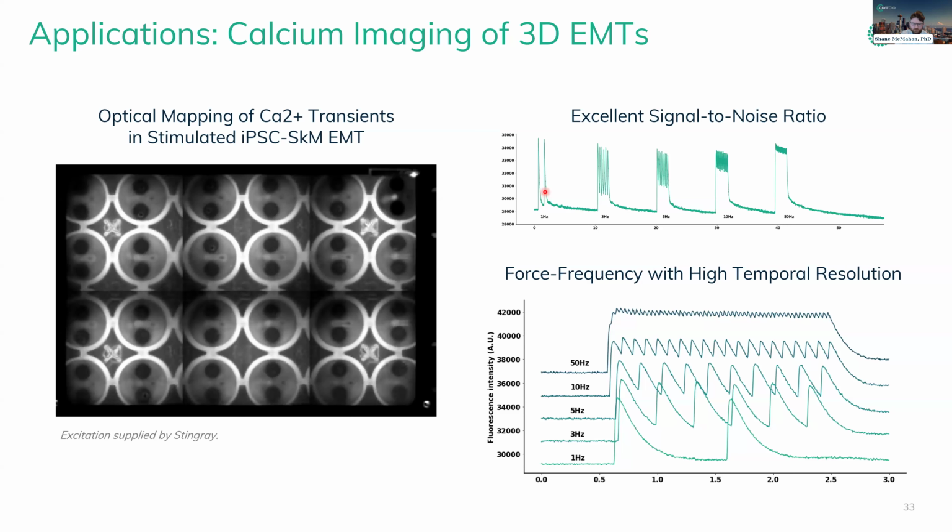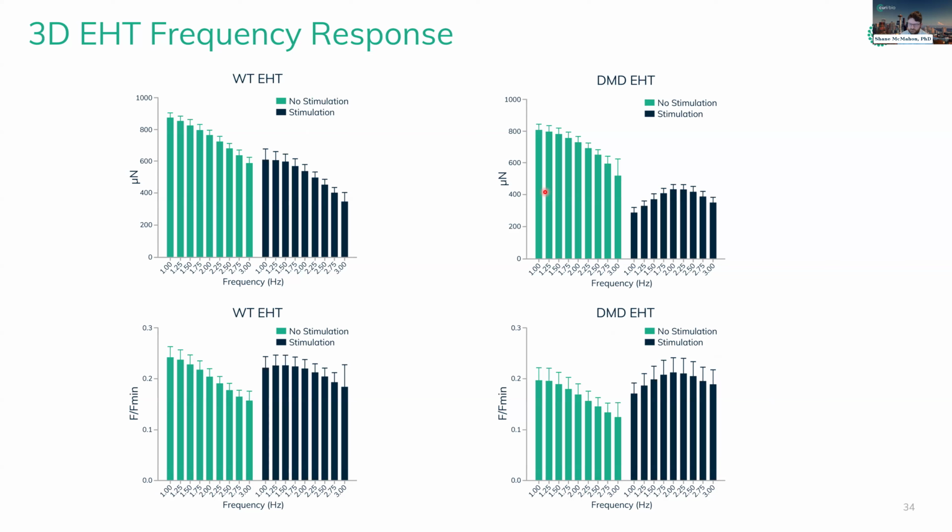As these tissues mature, we would see the expected in vivo result for skeletal muscle tissues. For heart tissues, on the other hand, the state of the art is a little bit different. It's well documented in the literature that the EHTs don't fully mature yet with how they're being made. So this is a problem that we are actively working on, and we made some recent progress.